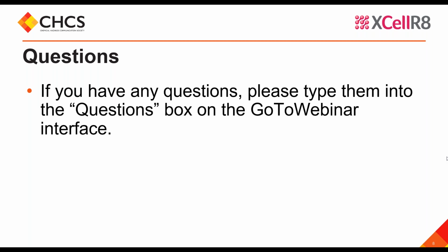Okay, another question. So if the expectation is irritant versus non-hazardous, using the bottom-up approach, which is the best test method to use?